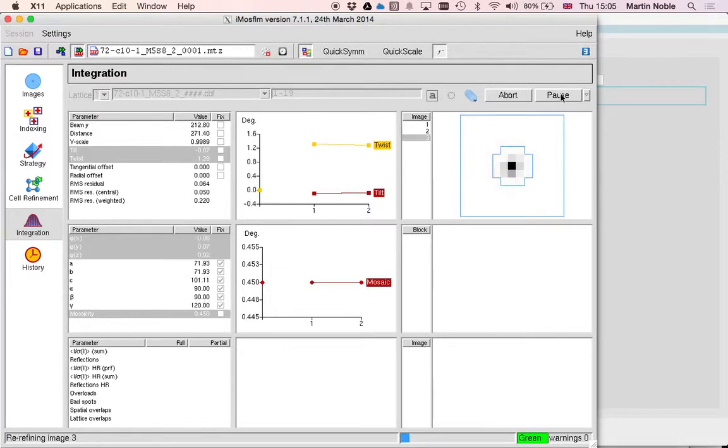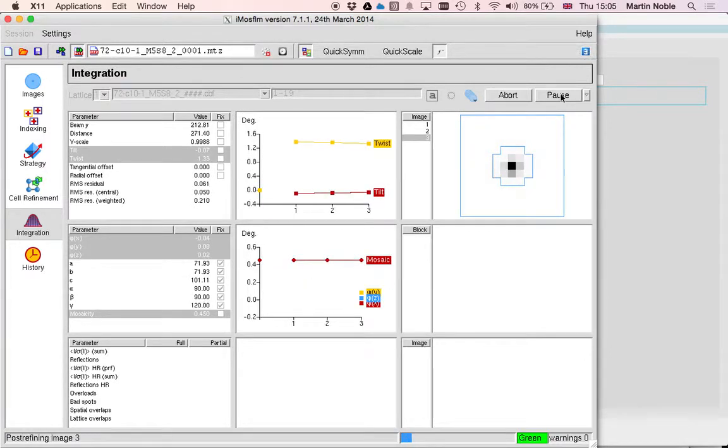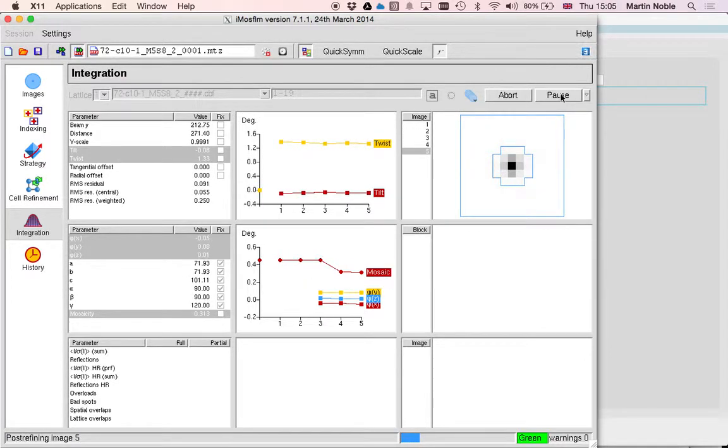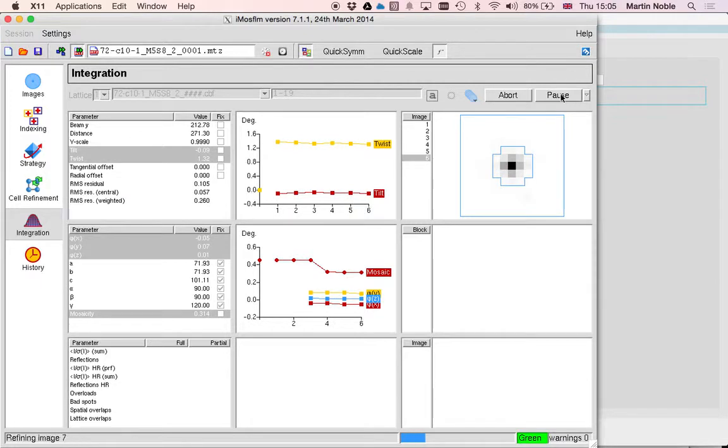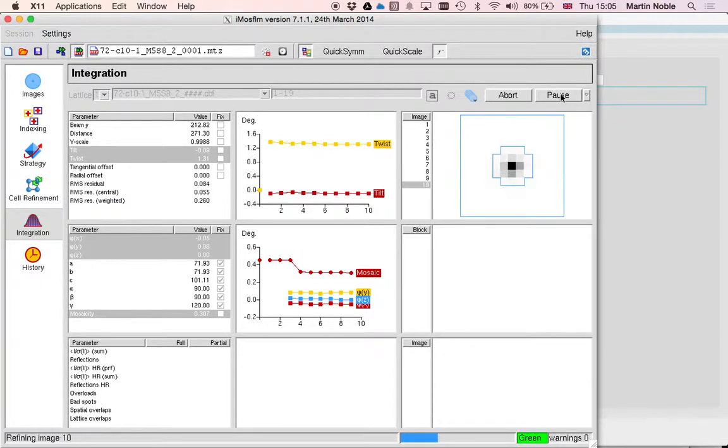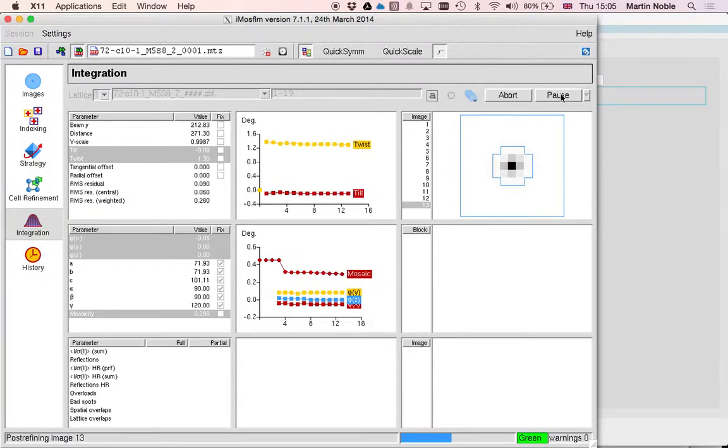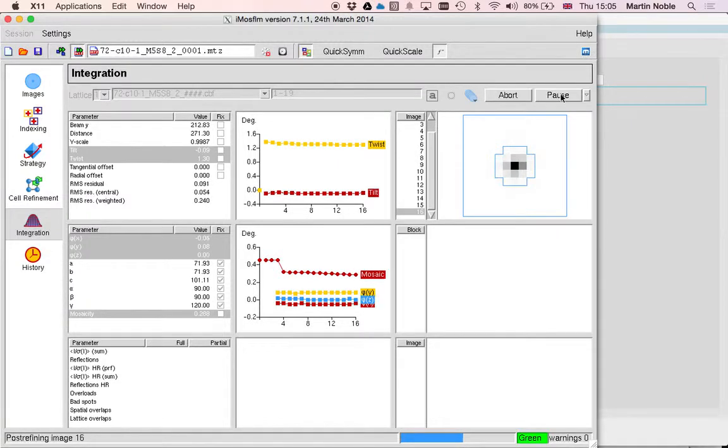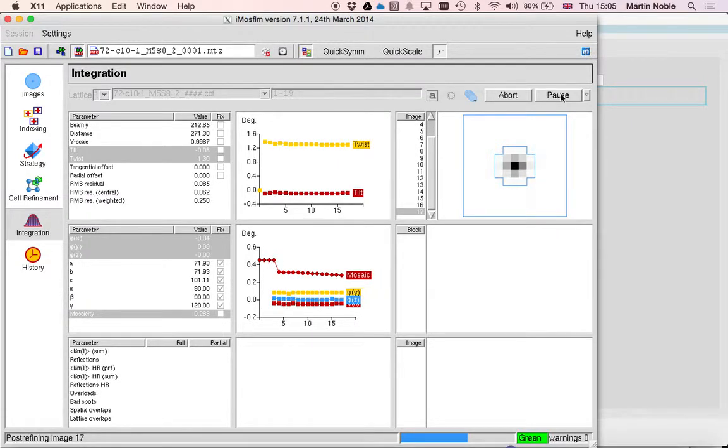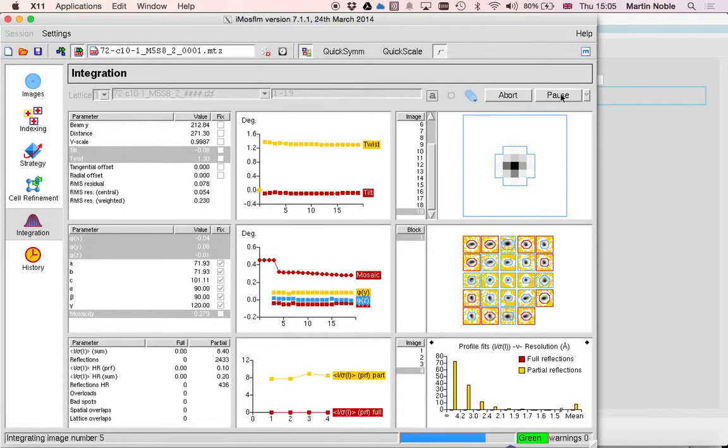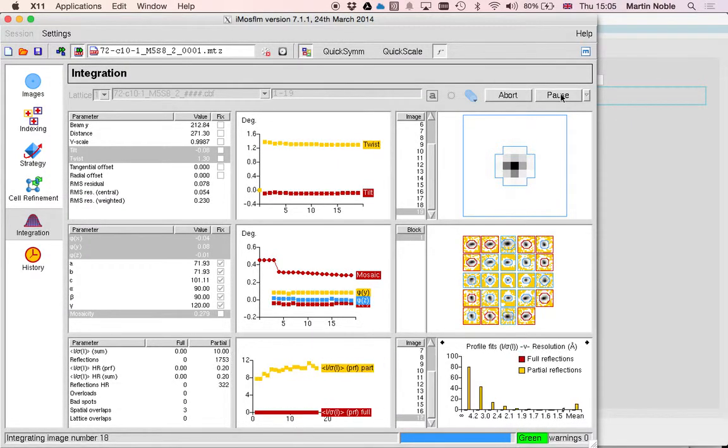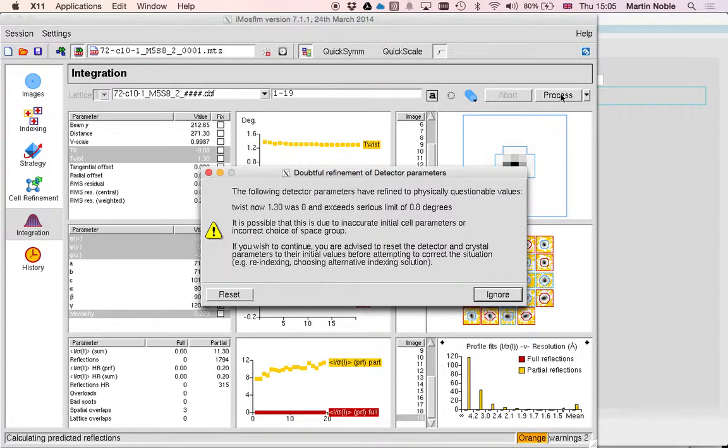Now one of the nice things about MozFilm is this lovely report that it gives you, image by image report on the quality of the processing but also on the parameters of the diffraction experiment as they refine throughout. And that gives you a good indication of how your experiment has run.